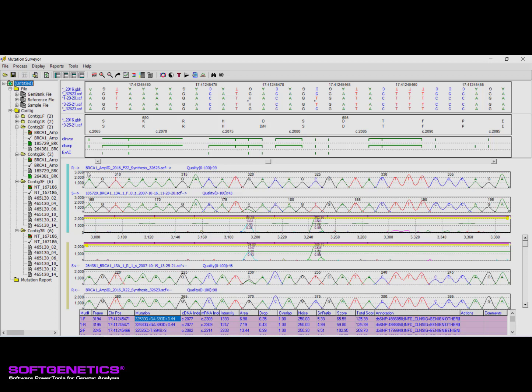Please note that reference traces derived by the software, which occurs when no reference traces are loaded into the project, include the word synthesis in the file name. The mutation trace highlights the uniqueness of Mutation Surveyor by providing key information for project analysis, including the results from the anti-correlation technique and other important parameters for variant detection.